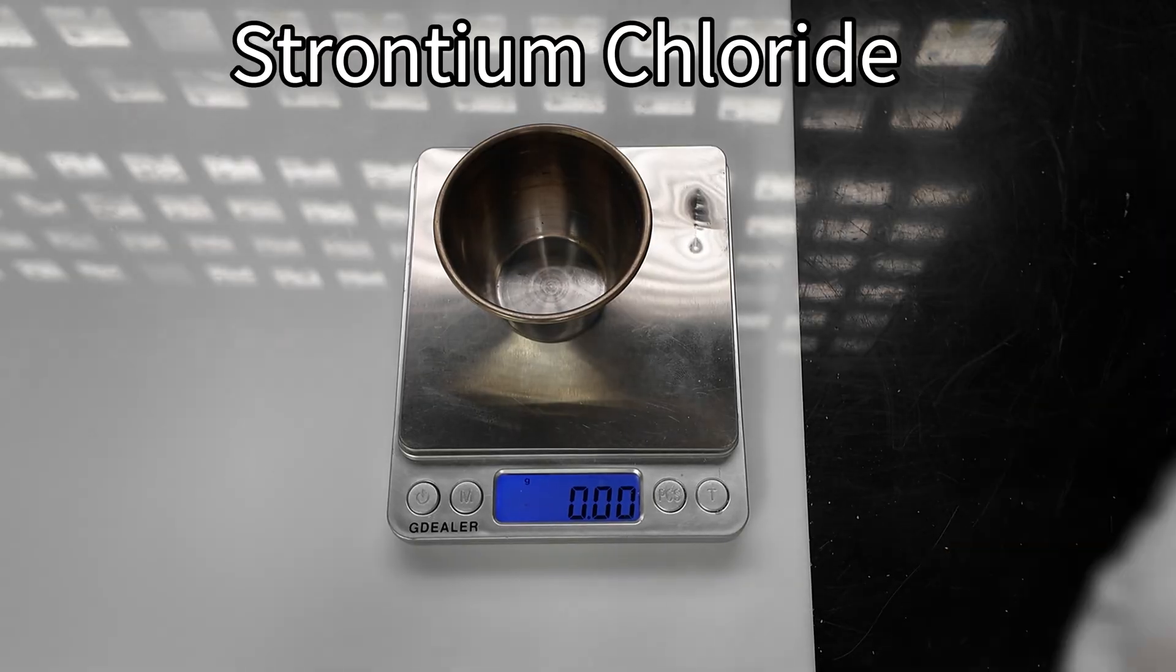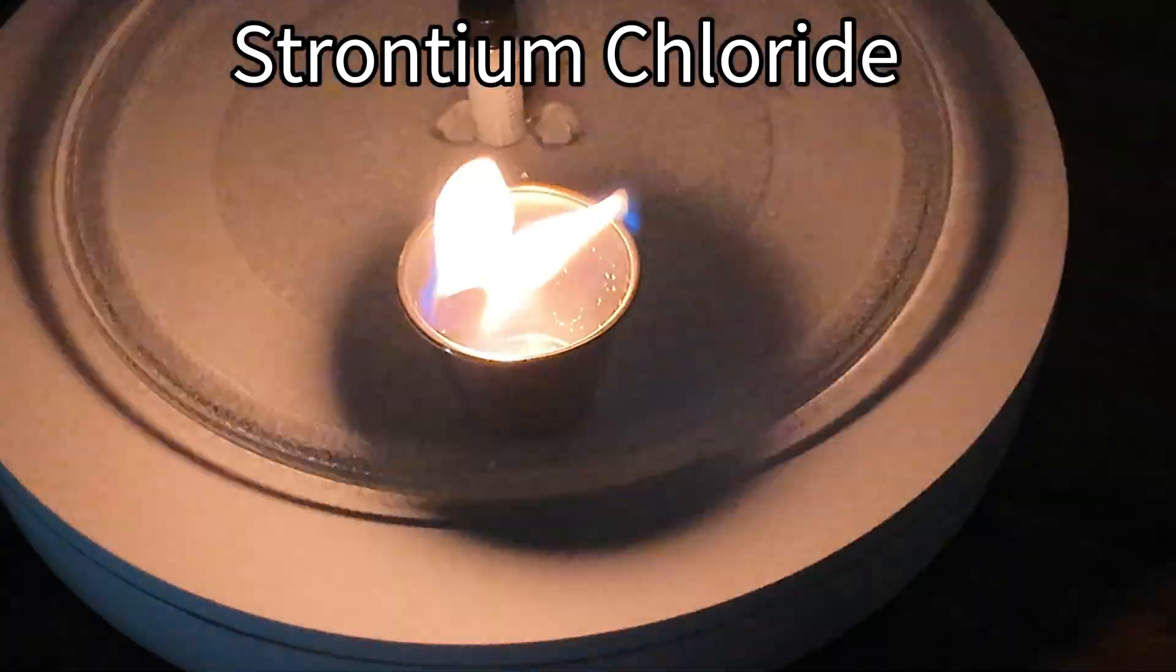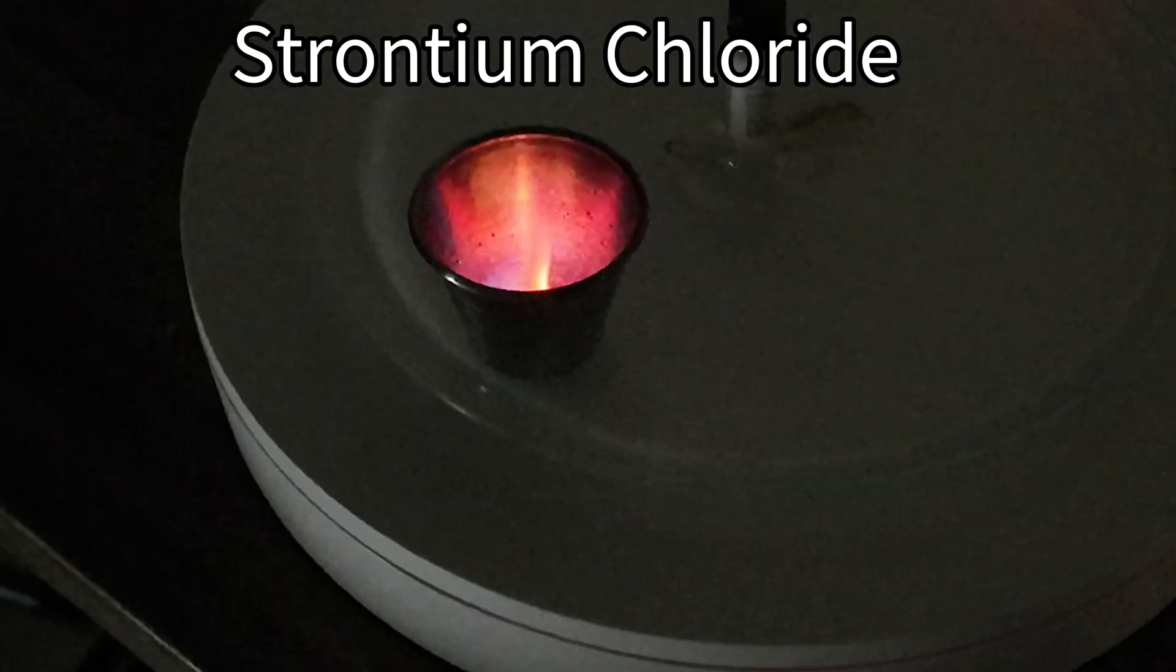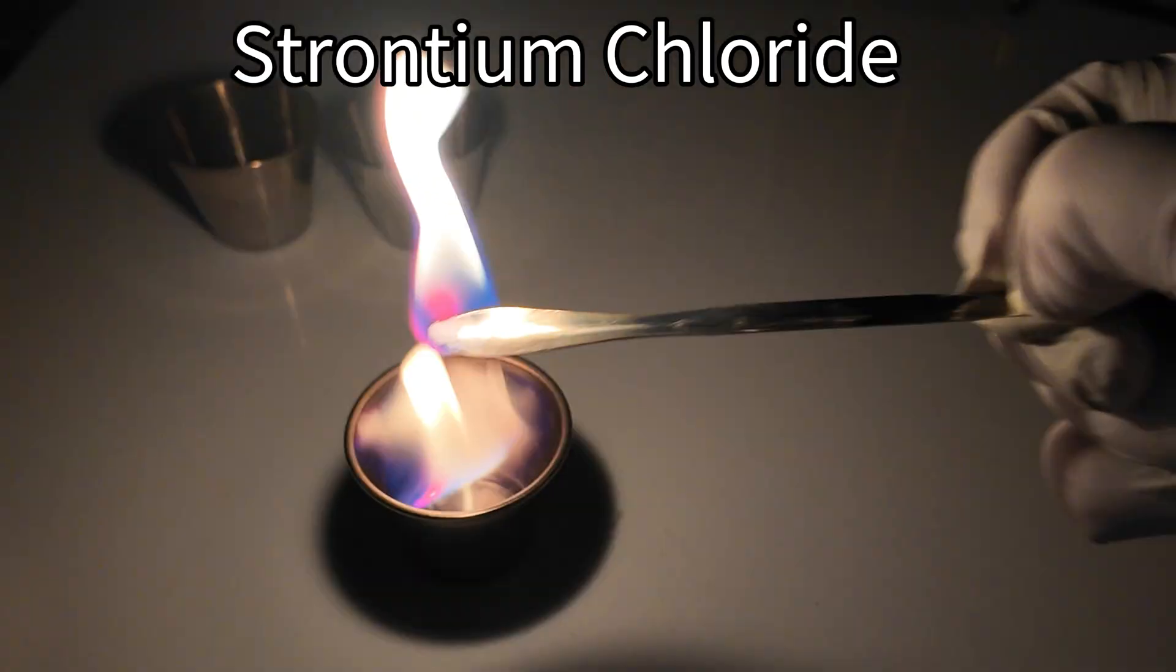Now let's heat up some strontium chloride. As you can see, when the strontium is heated, it turns into this deep red color. It is a lot more intense than the orange that we saw from the calcium chloride.